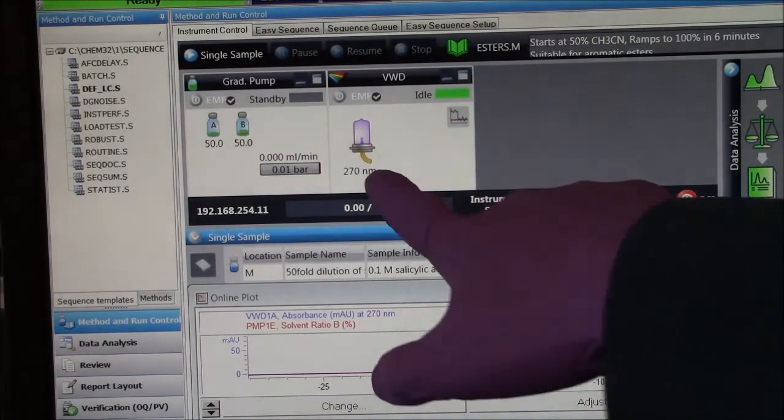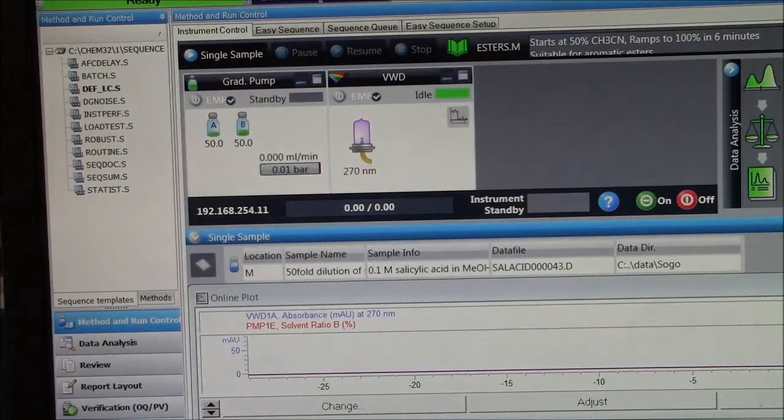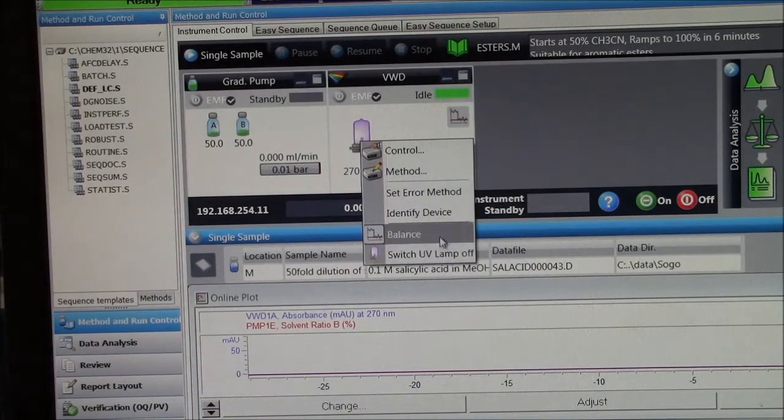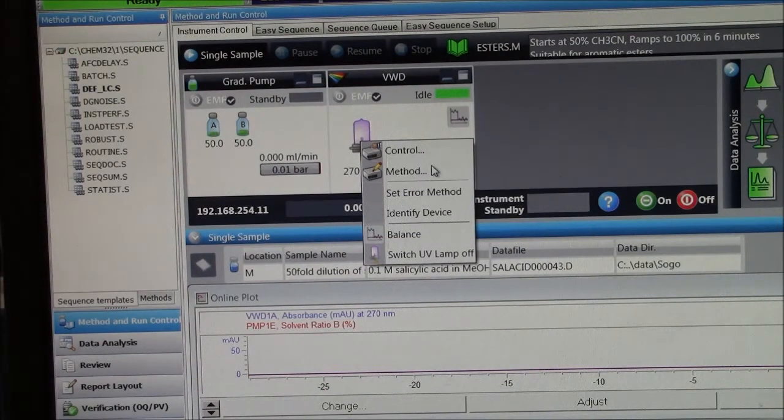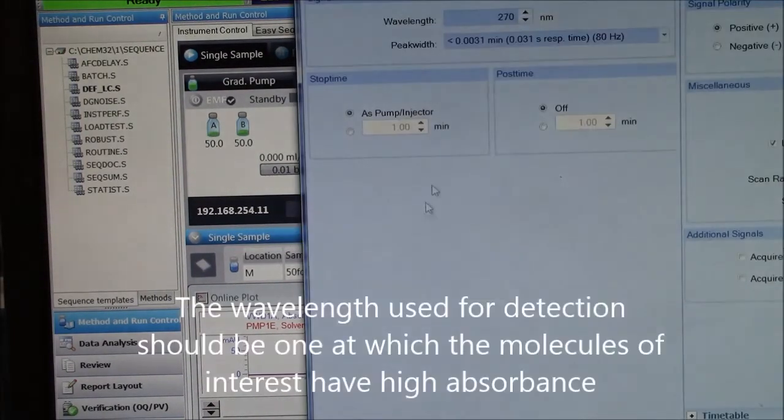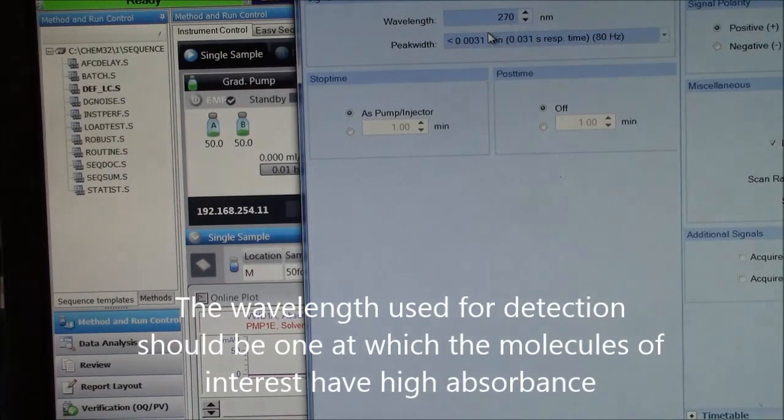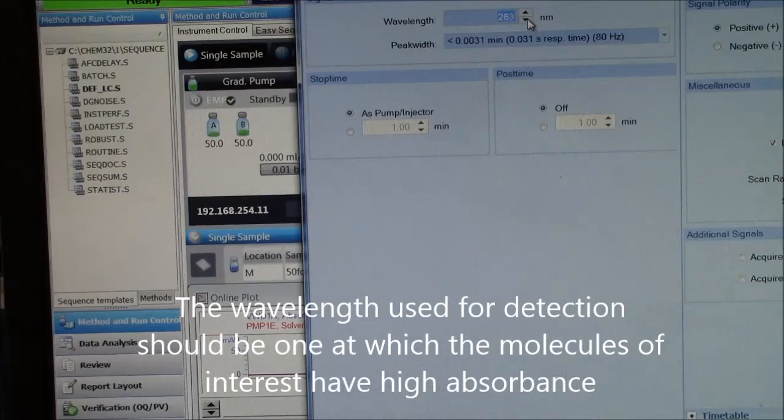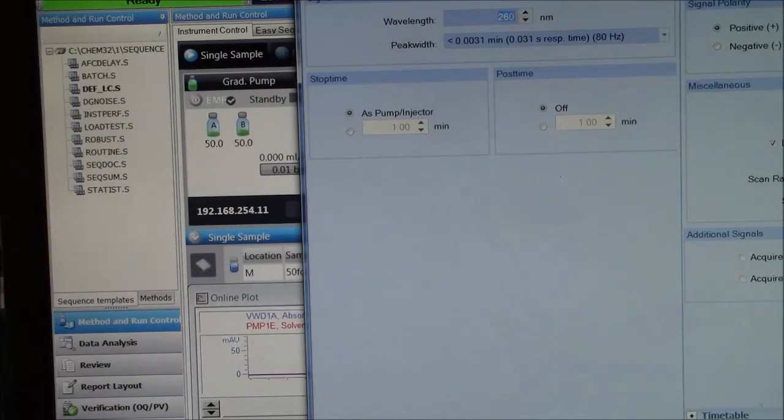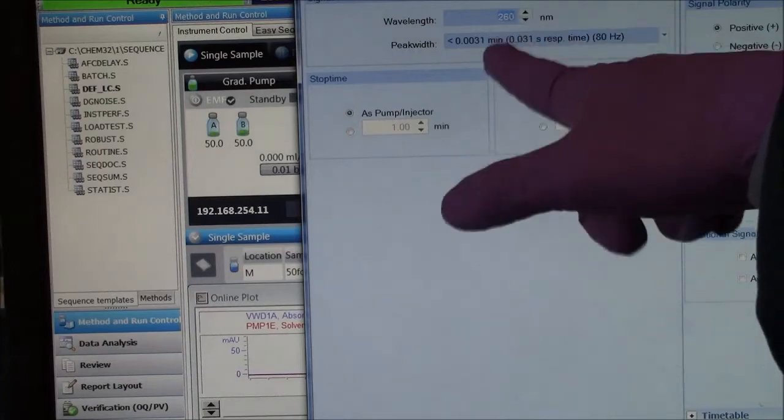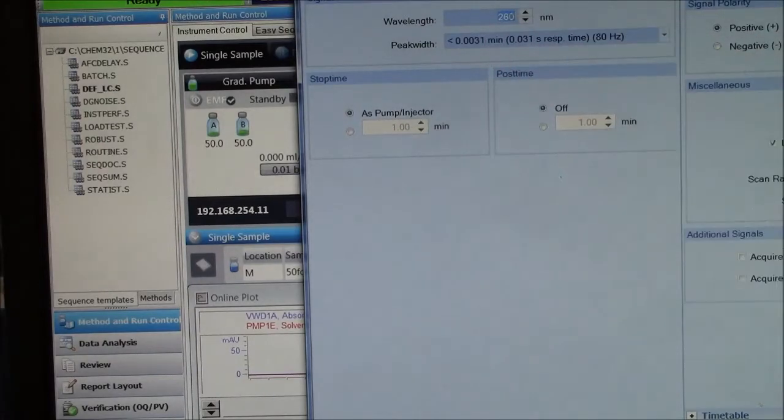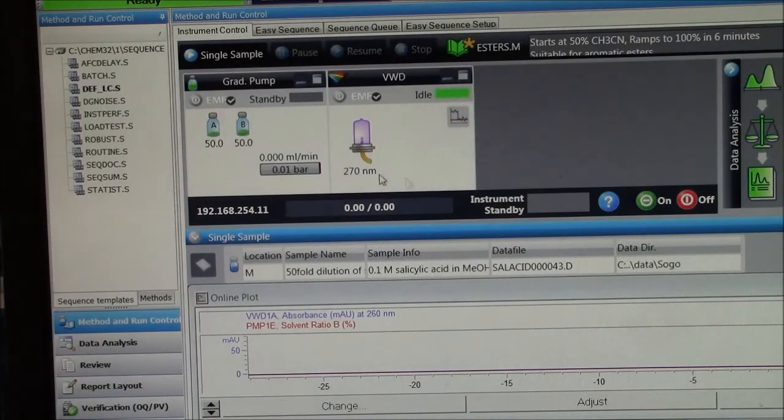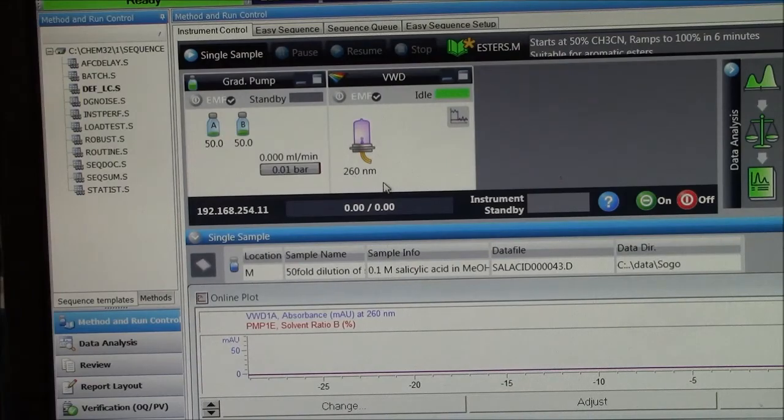So to change this to 260 nanometers, I'll do a right-click, and choose method, and up here, you can see it says 270. I can change that to 260. So to do this intelligently, you need to have a UV spectrum of your starting material, so that we know what wavelength it absorbs at. I click OK, and now this should change to 260, which it does.